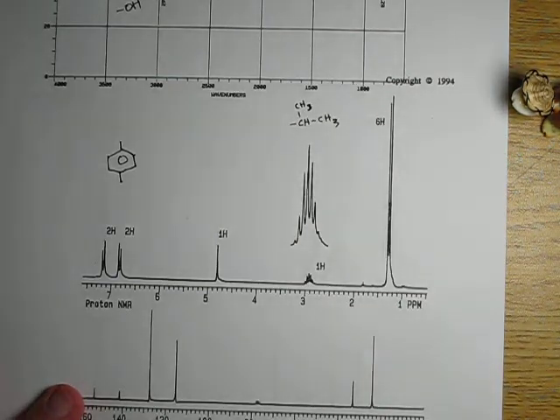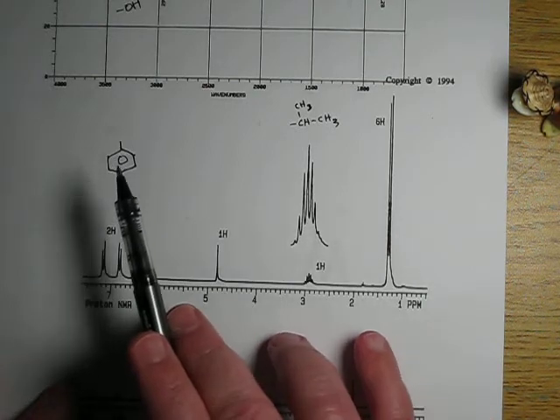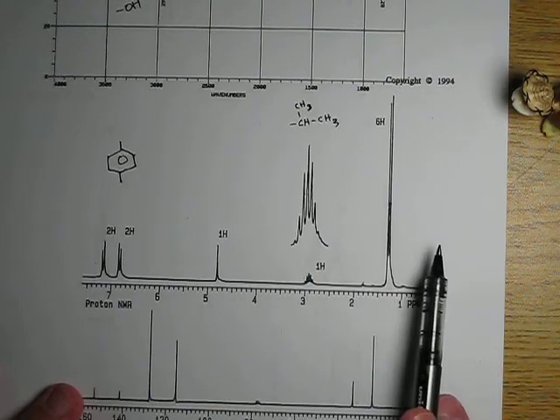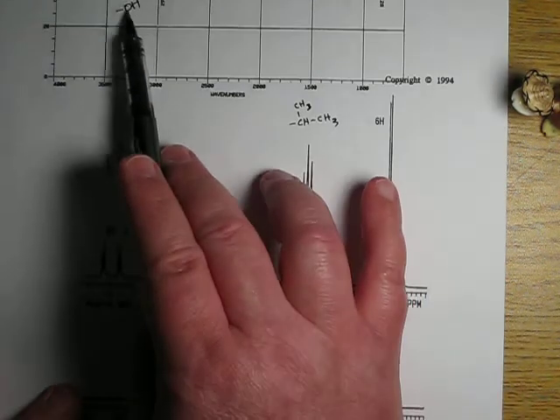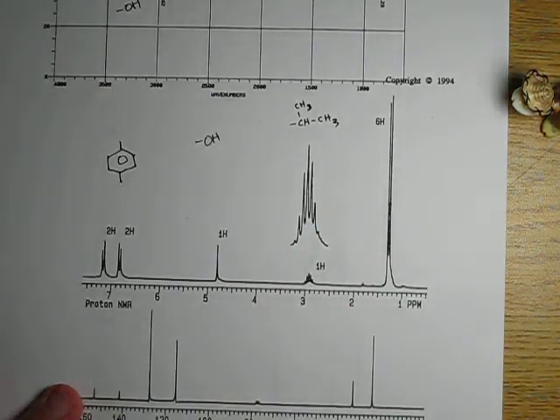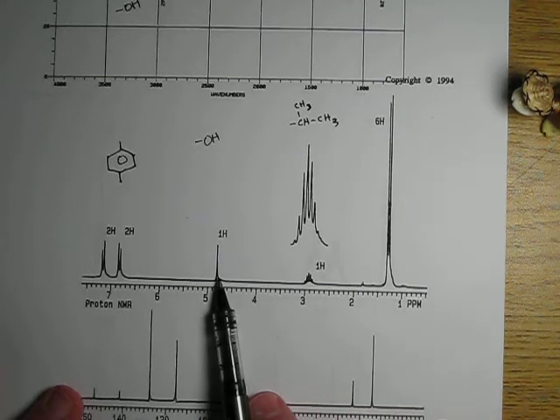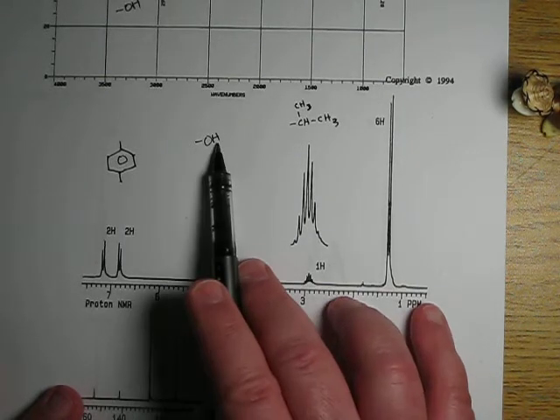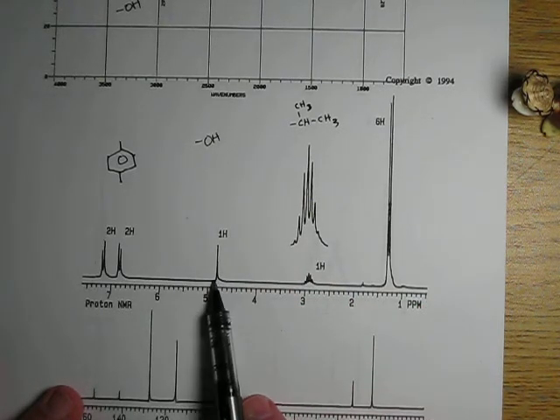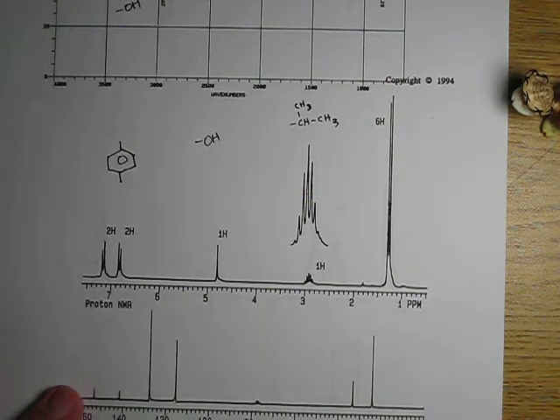Okay. And so I've got my para-disubstituted benzene ring for sure. I've got my screaming isopropyl, got that, and what else is there? Ooh, I know there's an OH. I know I've got an OH from the IR, but I don't know what that is. But wait a minute. The hydrogen of the OH has to be somewhere. That's probably what that is, because there's no other resonances in here. So this must be the hydrogen of that OH. Who knew? Well, I guess that's the way it goes.